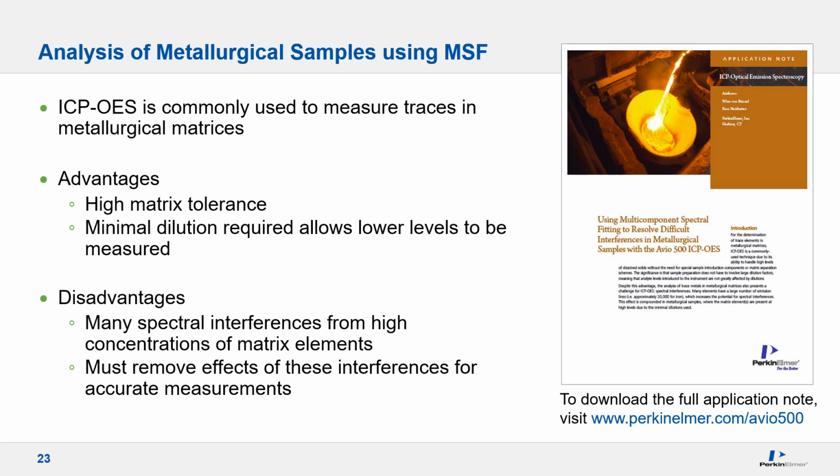Let's take a look at another example of using MSF, this time from a published PerkinElmer application note titled Using Multicomponent Spectral Fitting to Resolve Difficult Interferences in Metallurgical Samples using the Avio 500 ICP-OES.